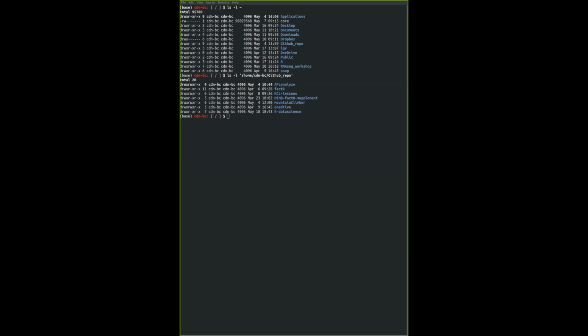So look at activity 1, and I want you to give it a try to list out the files in 3 different... Actually, sorry, before that. My apologies, there's one thing that I missed. If you go back to your terminal or your Git Bash right now, there's one thing that is quite cool, which is to list out certain files based on a pattern. For example, if you have a folder that has tons and tons of files, and you don't want to view all file names, there is a way to select just certain files, and we call this using wildcards.